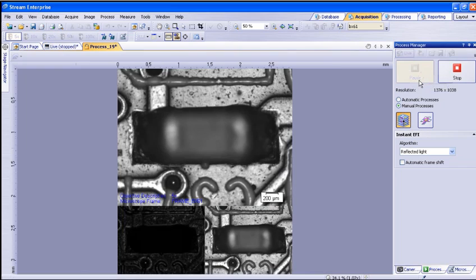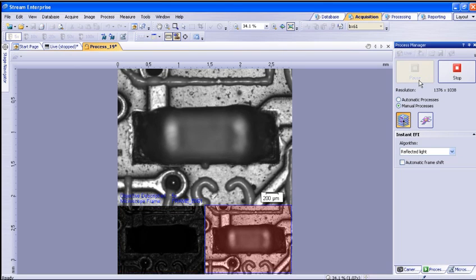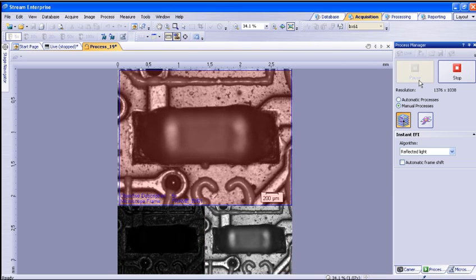After hitting Start, the main screen will change to show three views of the image. The bottom left view is showing the building of the focus map. The bottom right shows the live image at the current focal plane you have it set to. And the top main image is the EFI image as it is being generated when you change focus.